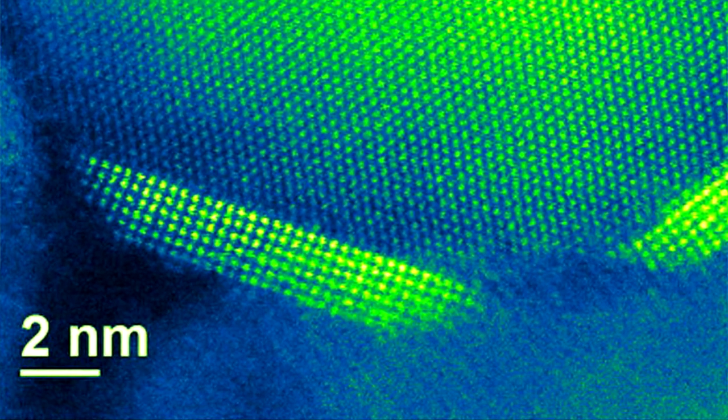Two of them are aberration corrected. This allows the highest levels of resolution to be used, and it also allows us to really understand how they function.